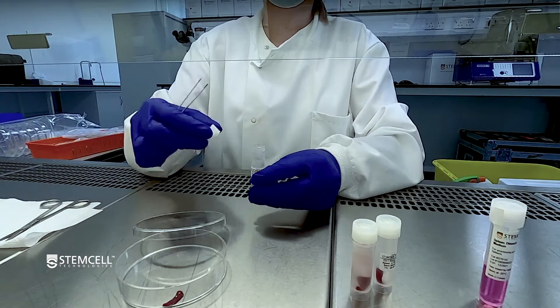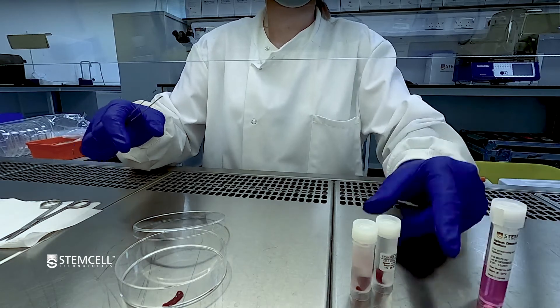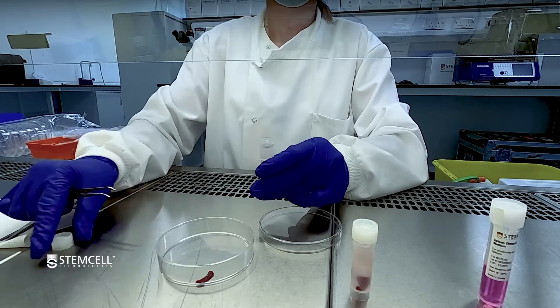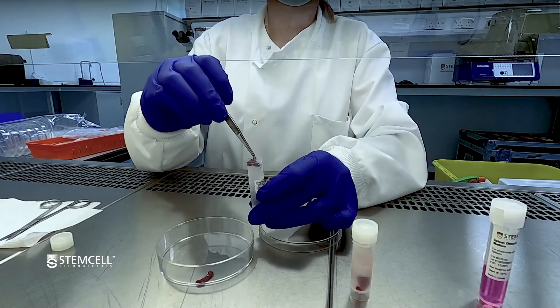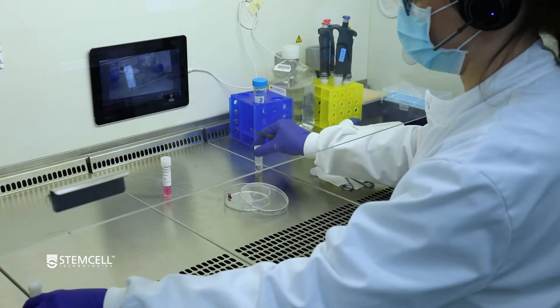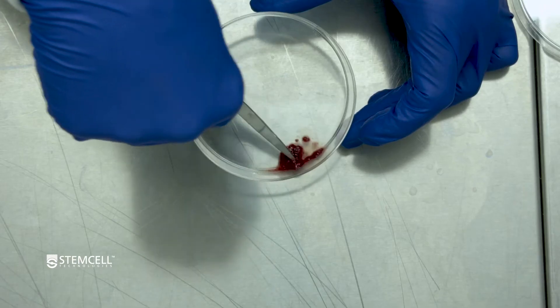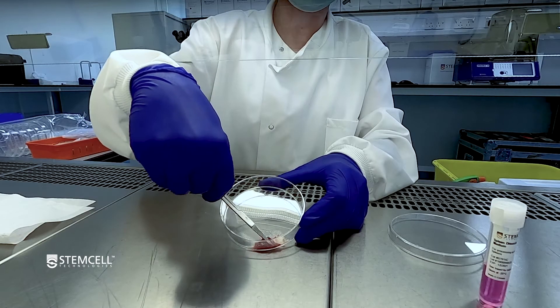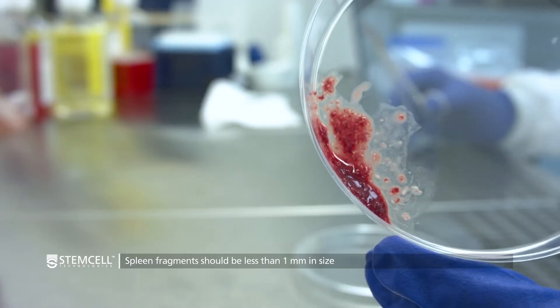To generate a single cell suspension for cell separation with EZSEP, begin by thawing a vial of spleen dissociation medium at room temperature immediately prior to use. Each vial contains 4 milliliters of dissociation medium, which is sufficient for up to 2 spleens. Transfer 1 to 2 freshly harvested spleens to a sterile tissue culture treated dish. Mince the spleens into a homogenous paste using dissection scissors and forceps. Spleen fragments should be less than 1 mm in size.